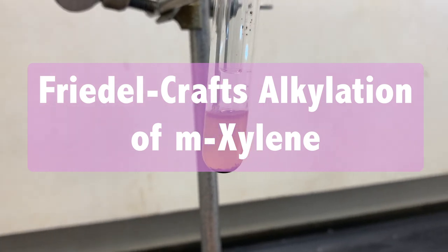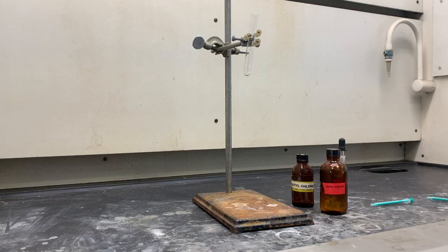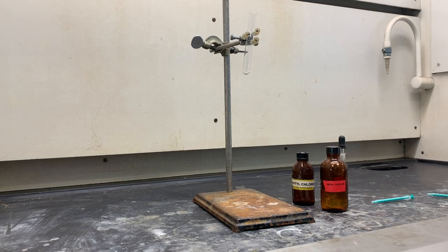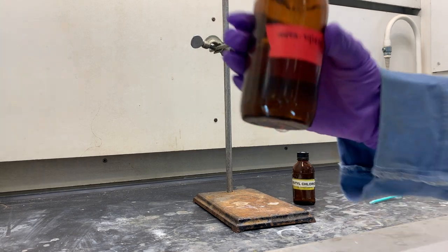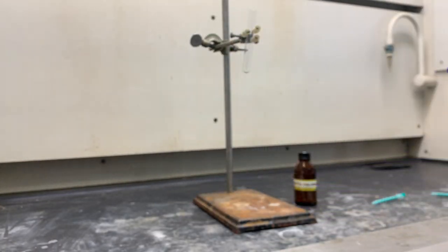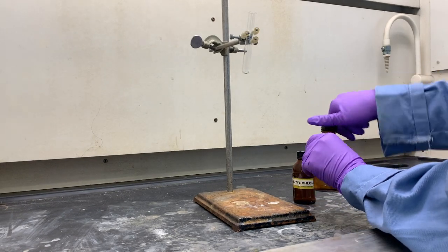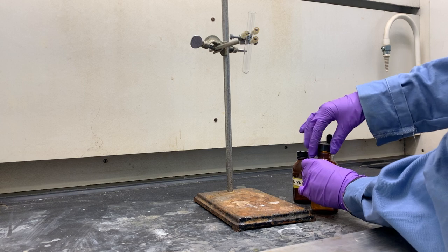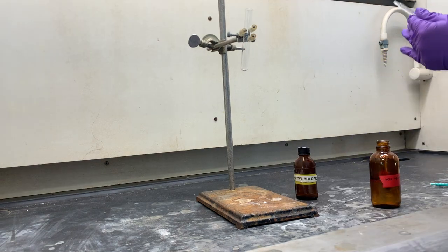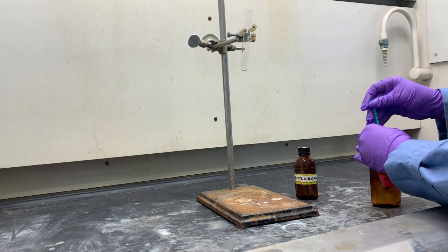Friedel-Crafts Alkylation of m-Xylene. The Friedel-Crafts reaction is used to prepare alkylbenzenes through carbon-to-carbon bond formation. Alkylation of benzene involves an electrophilic aromatic substitution mechanism and requires a strong Lewis acid, such as aluminum chloride or ferric chloride, as a catalyst. In this experiment, m-Xylene will react with tert-butyl chloride in the presence of ferric chloride.